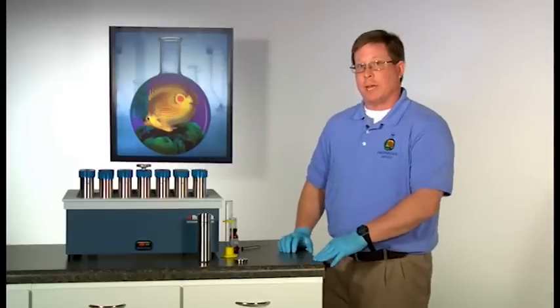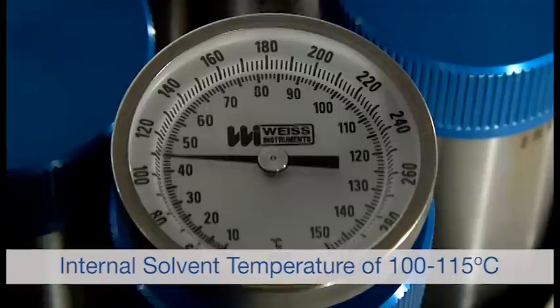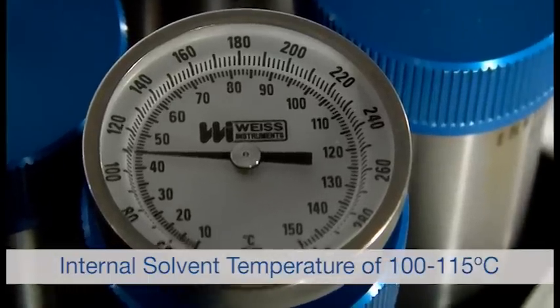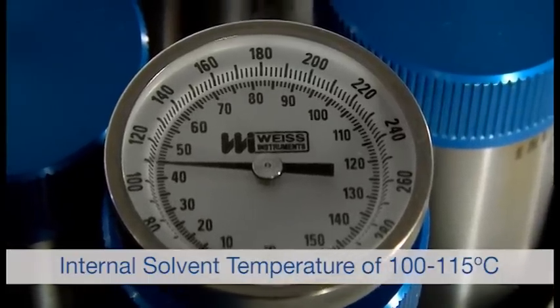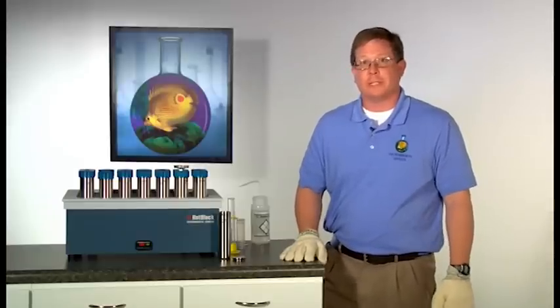The hot block should be set at 130 degrees Celsius. This will provide an internal solvent temperature of 100 to 115 degrees Celsius, which is required by method 3546. Samples should be heated for 30 minutes at the 130 degrees Celsius set point.